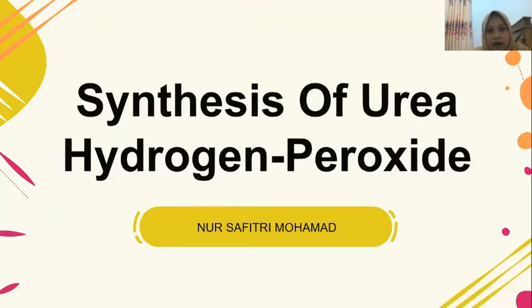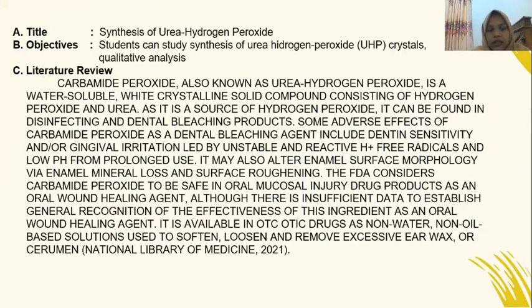I'm Nur Safitri Muhammad, a student majoring in Chemistry, State University of Gorontalo. On this occasion, I will present the result of the practicum that I have done. My practicum this time is entitled Synthesis of Urea-Hydrogen Peroxide.